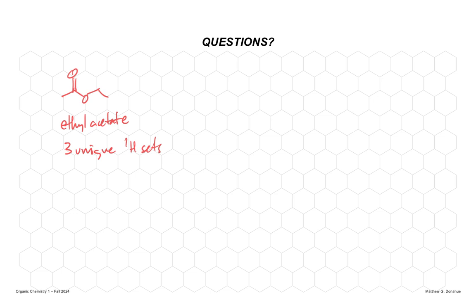And the way that I can say that is if you look at this methyl group, you see it has no neighbors, so it's blocked. And so that's its own little thing. So that has to be a singlet. Then sp2, then oxygen. Then you have this CH2, CH3. So that spin system, it's blocked by this oxygen, right? Because there's no neighbors there. The sets in that fragment do not communicate over to that fragment. So that's why we can say they're different spin systems.